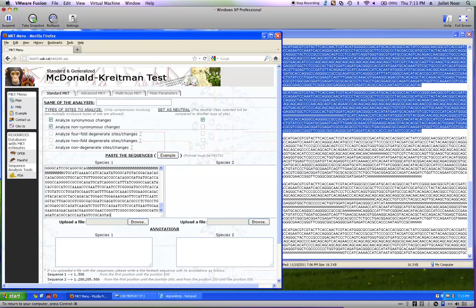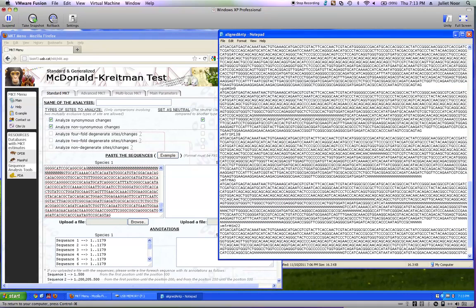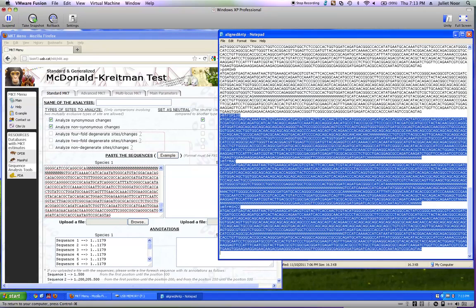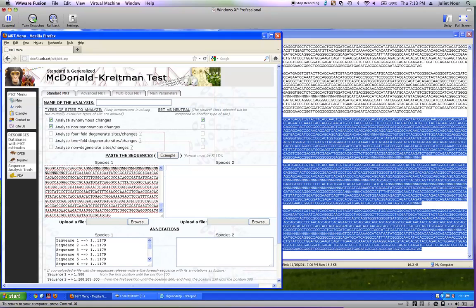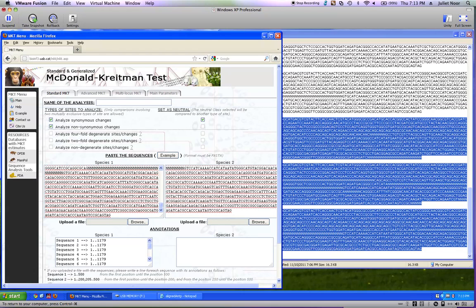Paste them into Species 1. Notice down here it now says we've got 11 sequences of pseudo-obscura, and that they are 1179 bases long, which is the same number we had in MEGA. That's good.